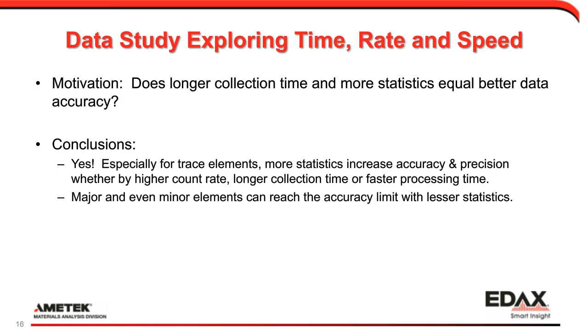And for us, for this experiment, we were at a sum total of 500,000 counts per second. If you were looking at major or minor elements, I would suggest that anything above 100 to 200,000 sum total spectral counts will probably give you similar results. Those are recorded on previous webinars that we've reported with some materials with higher concentrations, and we consistently see that this range of sum total counts is going to give you data that has values close to the known values.